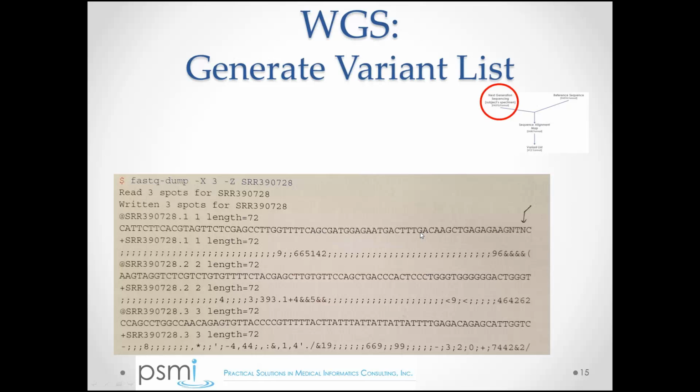Trying to give a quantitative description of the overall quality of a FASTQ file is a little bit tricky, because in the end a lot of these reads are going to be stacked together in the sequence alignment map, and the overall certainty by which you call a base is going to depend on a number of different factors.